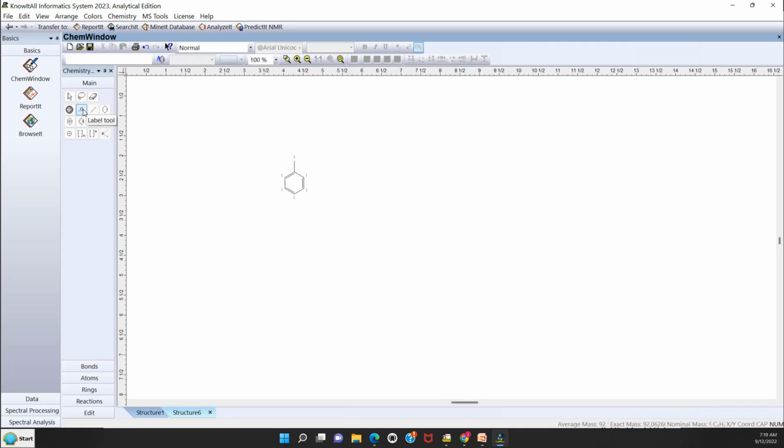To do that, hover over the little thing that looks like oxygens with bonds on either side. That's the label tool. If you click on it now, you'll see a little flashing bar, and that's where we can insert our user-defined elements. I'll hold down the Shift key this time to get just a capital A. It means something different here. It's not trying to put in a hotkey atom. And then I'll let go of it, and I'll put in L to get aluminum.